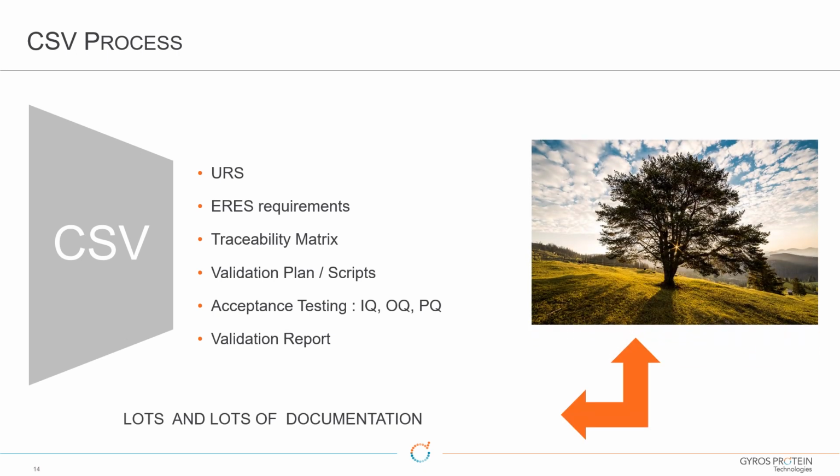Right, and so the idea is we use electronic records to reduce the number of paper documents out there, but it creates a lot of paper in the process. Yeah, I remember once talking to a regulator, and they were more impressed with how much paper was generated as part of the process and what the actual documents said. Yeah. So it is important, it's something probably in the future that can be streamlined, I'm sure. Yeah.